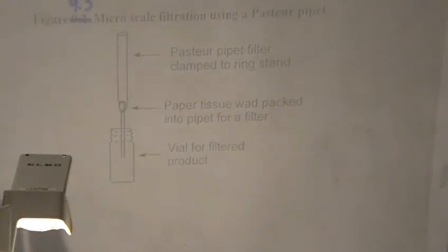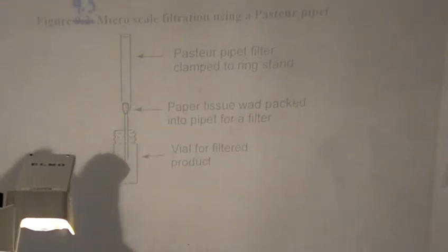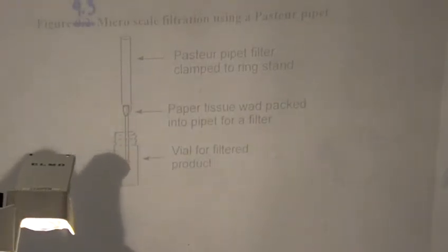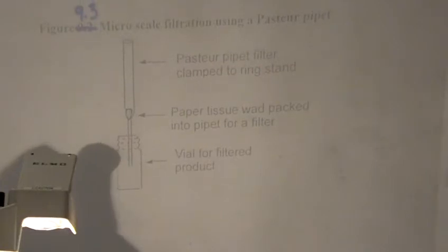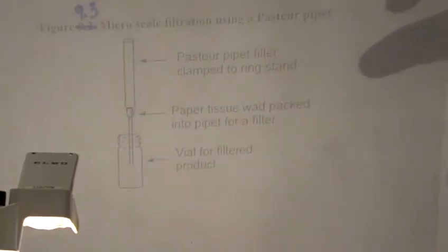we're going to use this apparatus from experiment 9 to actually filter the magnesium sulfate off, okay? So what you're going to want is a clean, dry vial that your alkene product is going to go into. I recommend knowing the mass of that vial too, because then you can easily figure out your yield. Then you're going to take your flask that you have the magnesium sulfate and your product in, and you're going to pipette from that flask into this filtering pipette that will then drain into that vial, okay?